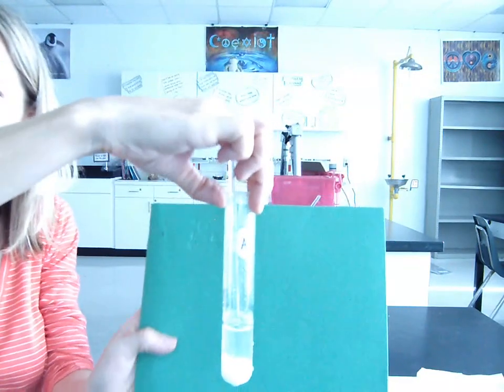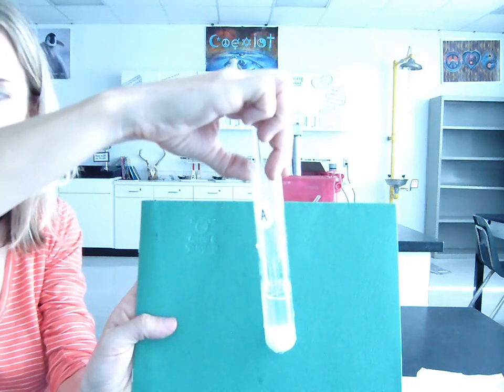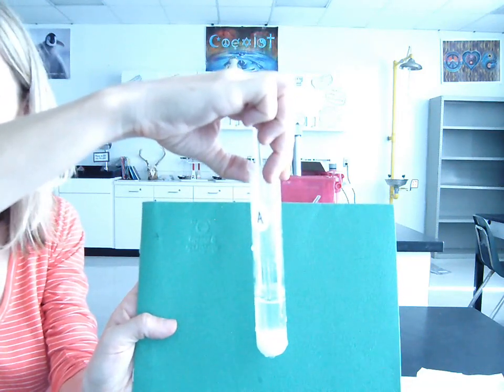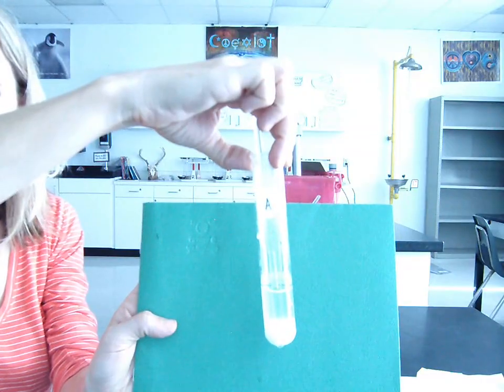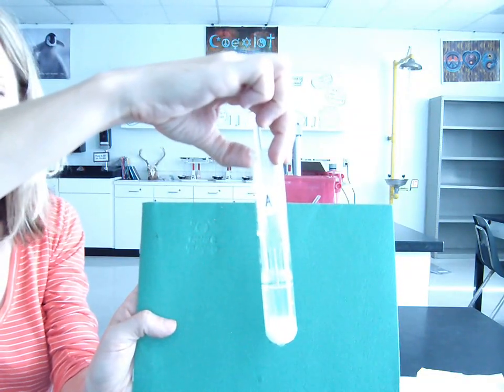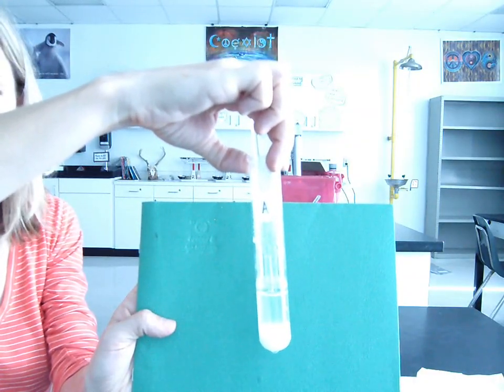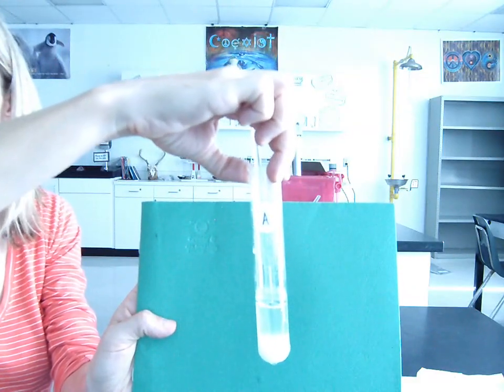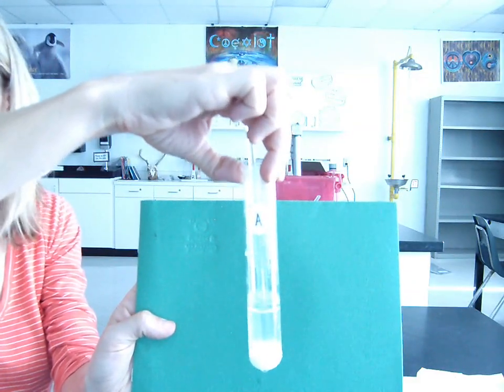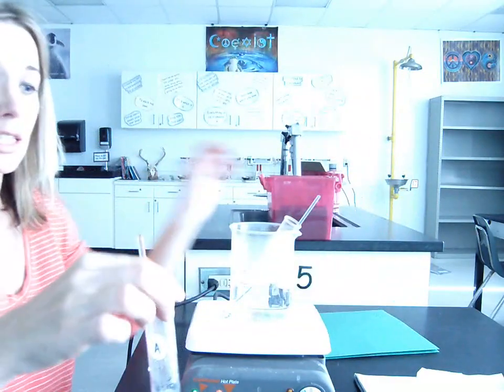Substance A, on the other hand, does not appear to have changed. So if any more of substance A dissolved, I mean, it's possible that some of it did, not enough to make it obvious. So it appears that substance A, when mixed in water, is not really that affected by temperature. So even when we heat it, it does not become more soluble, at least as far as we can tell just by looking at it. So that's the second part of the lab.